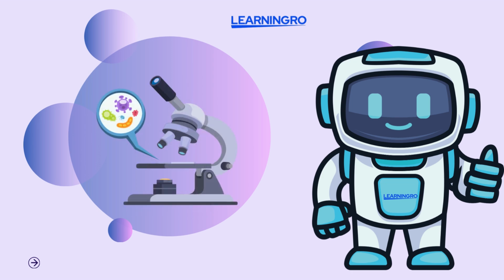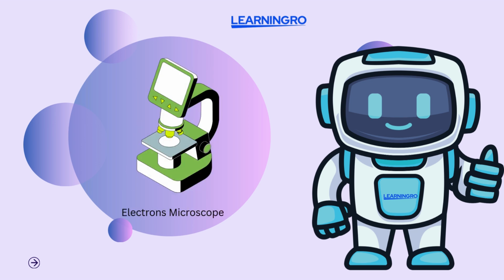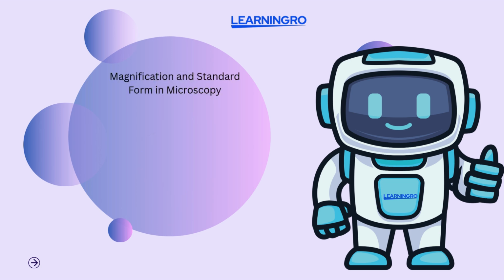2. How microscopes work. Microscopes help in viewing and studying small objects by magnifying them. Here are some key points about how microscopes function. Light microscopes use light to visualize specimens, making them useful for examining cells and simple structures. Electron microscopes provide much higher magnification and resolution than light microscopes, enabling the observation of intricate subcellular structures like the nucleus, ribosomes, and plasmids. Advancements in microscopy. The development of electron microscopes has allowed for a more detailed understanding of cellular structures.